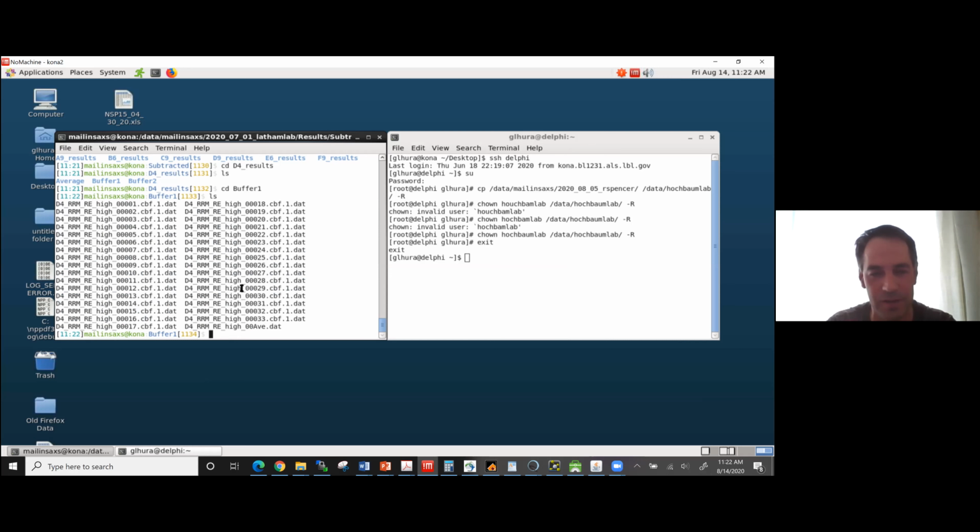But if it's not working and you're super keen to get this going, we've got a command line version, which you can copy. If you log into our system and copy it, this is all Python code. So it's this one, regions and num files, and then *1.dats.